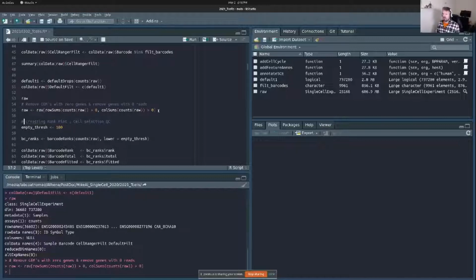So what you can do is try to find outliers. Anything that's an outlier from the mean, from the pool of RNA that was floating around and picked up in those gems from dead cells, fractured nuclei, the mitochondrial genes from dead cells, anything like that, if it deviates from that pool, it's probably actually a cell, right? So if the majority aren't cells, then the outliers are. That's how this algorithm works.